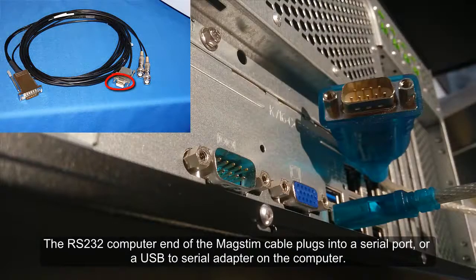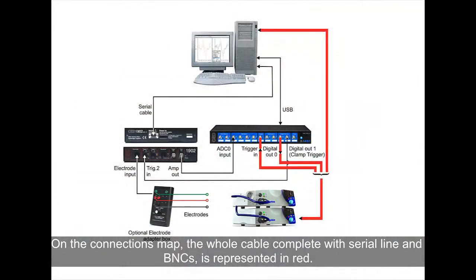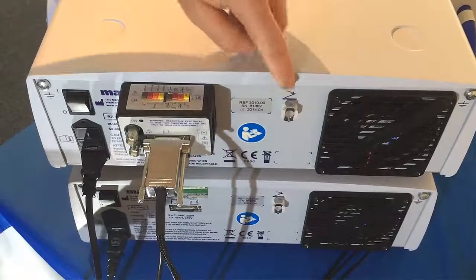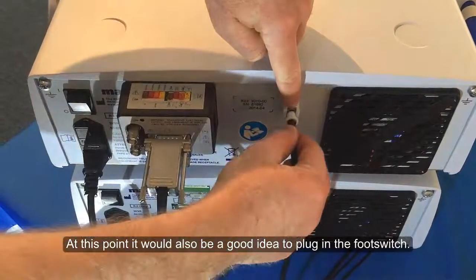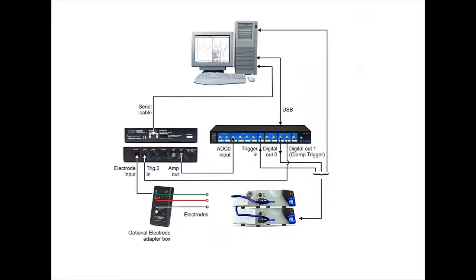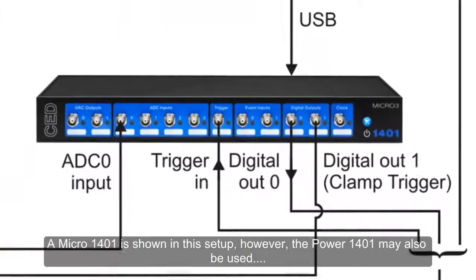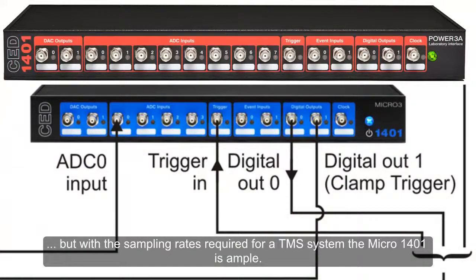DIP switches on top of the MagStim EMG interface module allow output pulse widths and polarity to be adjusted for compatibility with most third-party devices. This module is not required when setting up a system with Signal, since the 1401 responds very quickly to TTL events. The RS232 computer end of the MagStim cable plugs into a serial port or a USB to serial adapter on the computer. On the connections map, the whole cable, complete with serial line and BNCs, is represented in red. At this point it would also be a good idea to plug in the footswitch. A Micro 1401 is shown in this setup; however, the Power 1401 may also be used, but with the sampling rates required for a TMS system, the Micro 1401 is ample.